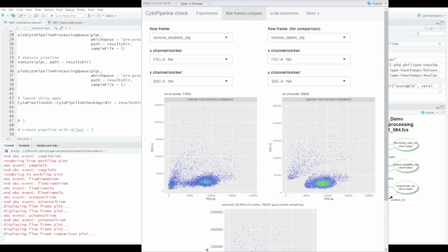well-defined clusters. So where does it come from that I originally selected this number of clusters equal to 3? Well, it was by looking at the data prior to processing, at what was observed before all these steps, for example here.